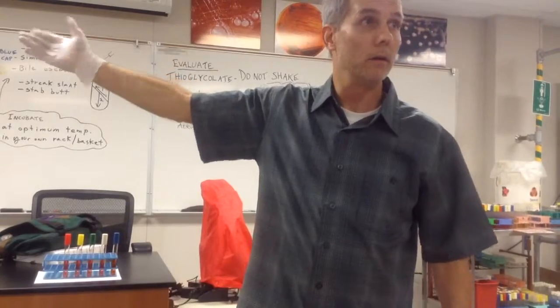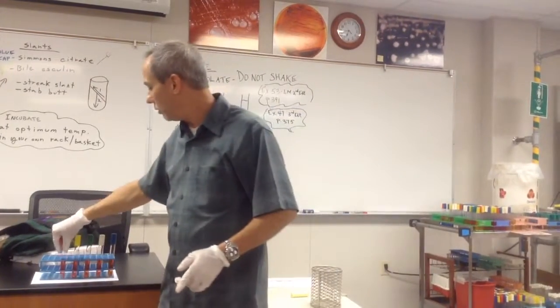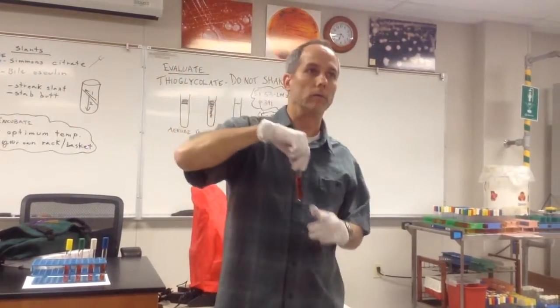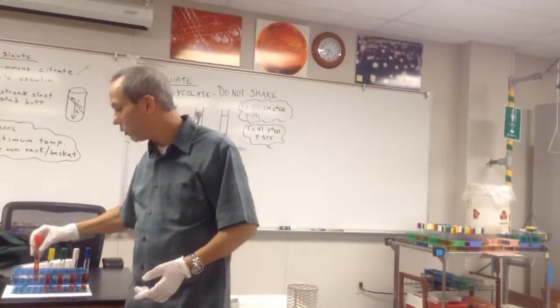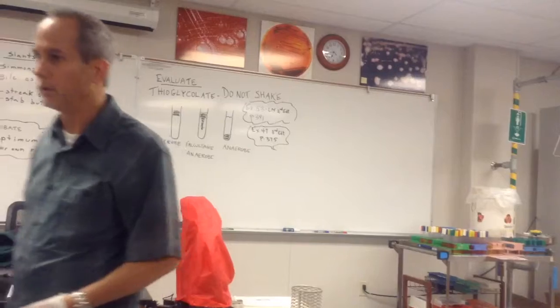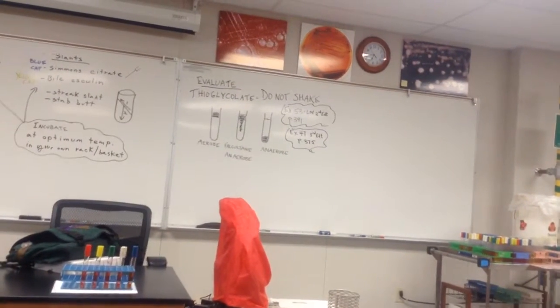Do you see that? You can't argue that they're going to turn yellow on their own, because these sit here for weeks and weeks and weeks, and it's not turning yellow. The only reason it turns is because there's an organism in there that waste products cause it to turn. So this is the number one question that people ask me every semester. Why is it orange? Yes, why is it orange?